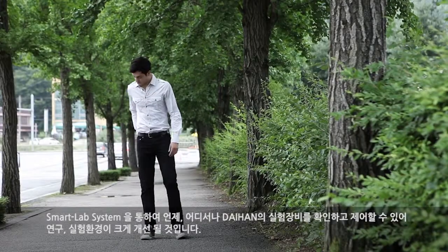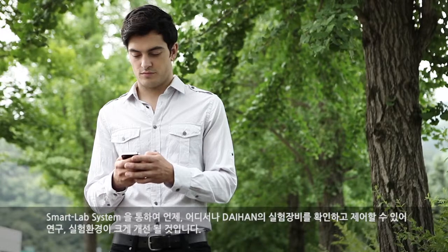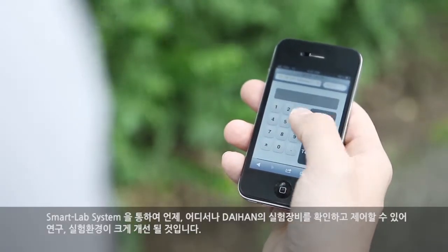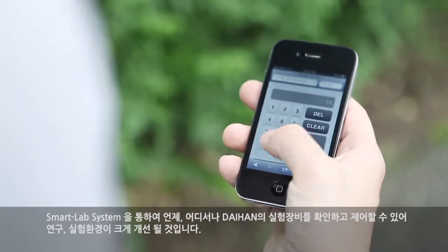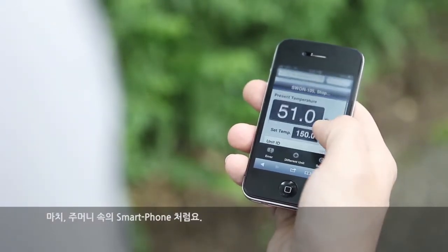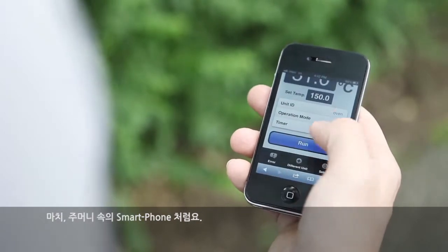Through the smart lab system, Daehan's laboratory devices can be controlled at any time from wherever, resulting in huge improvements for research laboratory environments — just like the smartphone in your pocket.